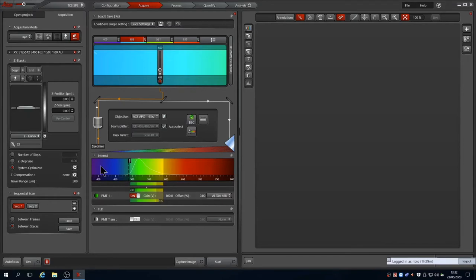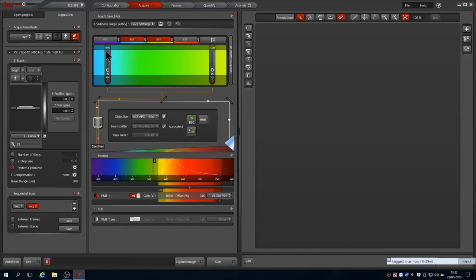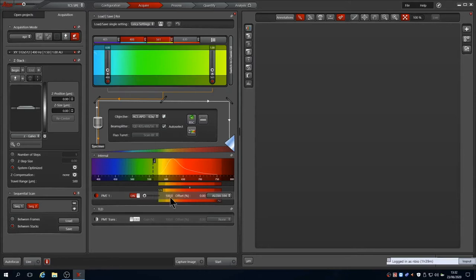Clicking sequence 2 loads the parameters for capturing it, which shows the 561nm laser is on at 1% power. The 488 laser is still shown, but you can see that the power is turned down to 0. The detector band pass has also been moved to cover the emission spectrum of Alexa 594.